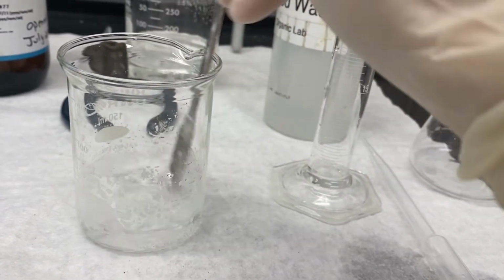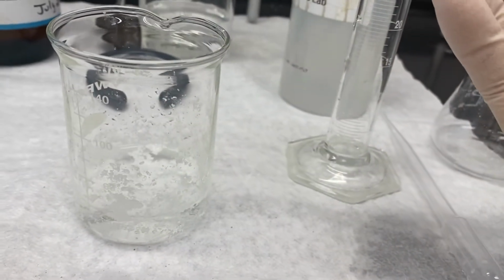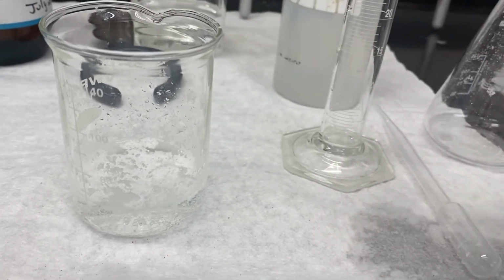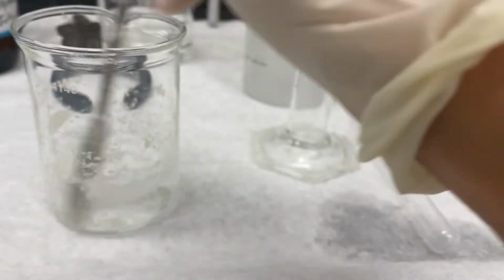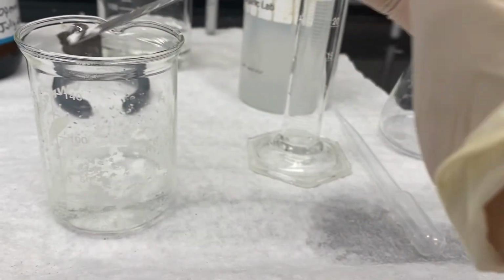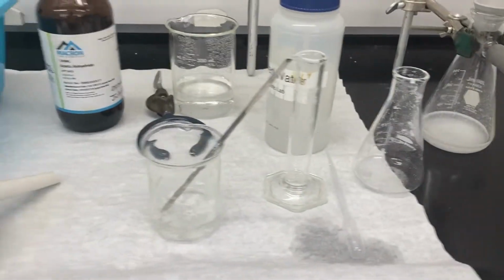So you want to kind of think about what this product could be. What are we separating this away from? It doesn't have a carboxylic acid on it. All right. So whatever does not dissolve, you're going to filter. We're just going to consider it waste. We're going to filter that away using a filter funnel, just by using a glass funnel.